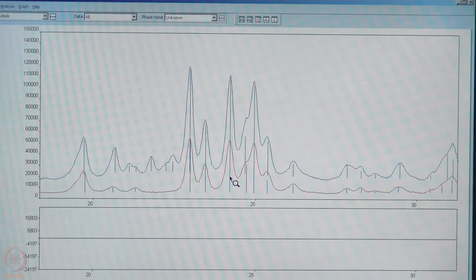that if we have forgotten to put the K beta filter, that is the nickel filter for copper radiation, we will get additional peaks. And then if we throw these peaks without knowing that they are from K beta, any indexing software will fail to index this powder pattern. So, the presence of K beta filter in all diffractometers is essential, and we must not forget to put that.